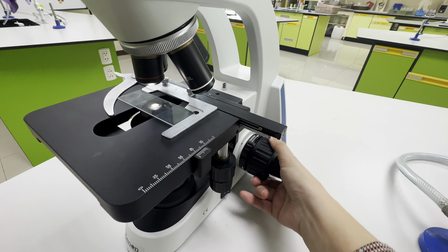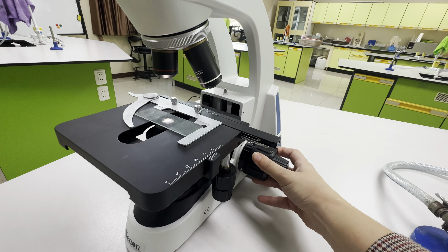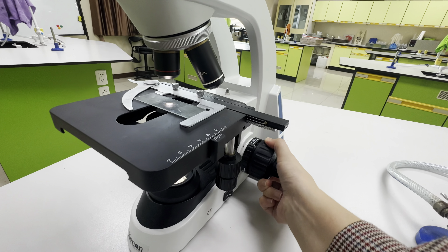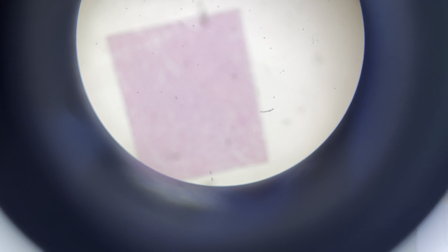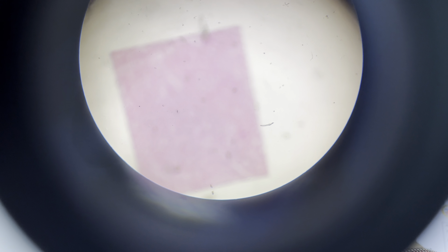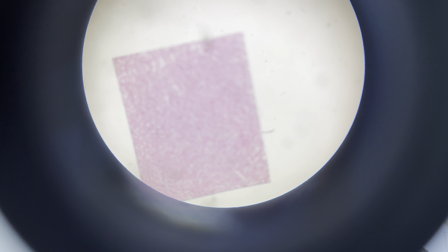The proper way to focus a microscope is to start with the lowest power objective lens first. While looking from the side, crank the lens as close to the specimen as possible without touching it. Now look through the eyepiece lens and focus upward only until the image is sharp. If you can't get it in focus, repeat the process again.